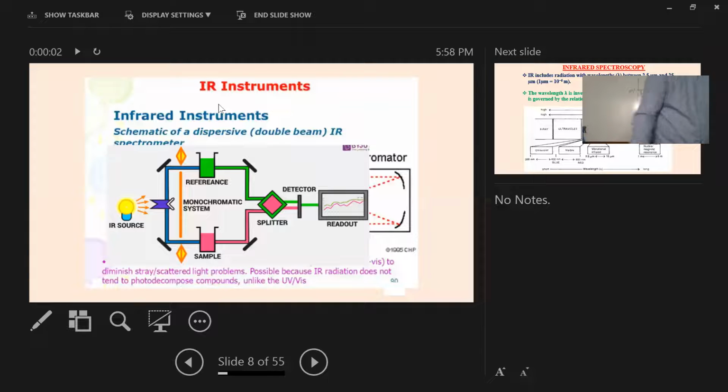Okay. Without here, it's not straight. The yellow color. Oh, okay. This is that one. Okay. That is actually, I would say, that should not be like that, because of the 100% absorbance or the light source. What we consider, if we change the wavelength, the light intensity does not remain the same most of the time.